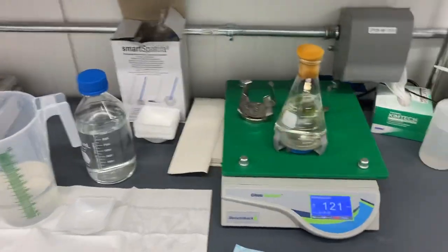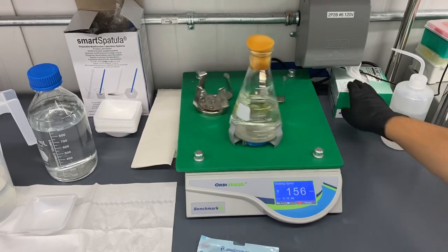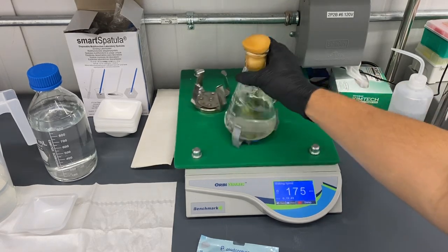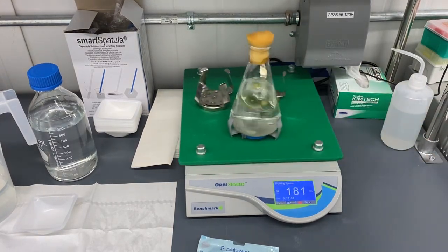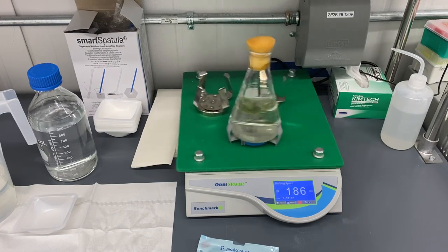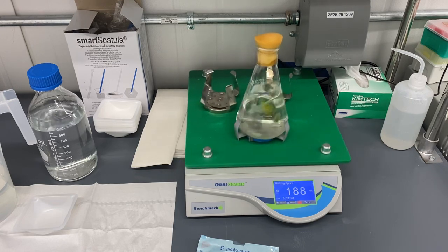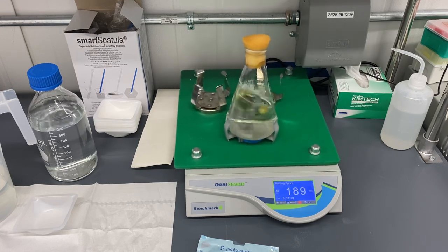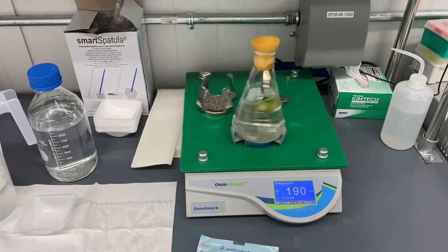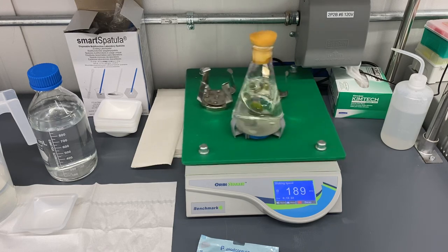With a shaker, you want it shaking pretty aggressively so that all of the material is moving around and getting washed. We're going to do that for about 25 minutes. I'll check it after the 15-minute mark to see how it's doing, and then we'll rinse off all of the bleach and go ahead into the induction of the tissue into media.